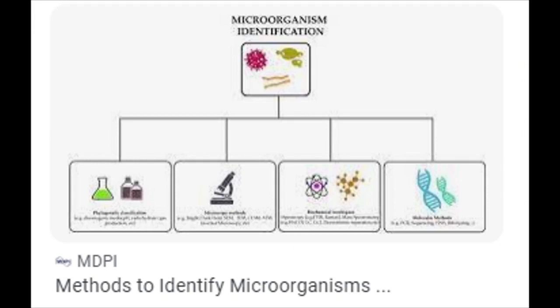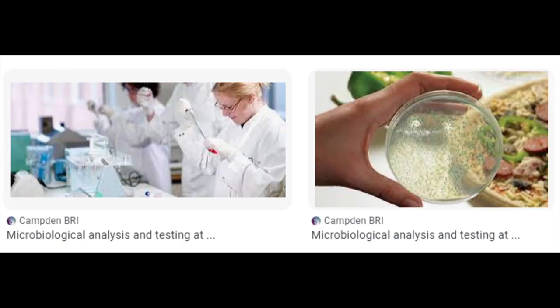So I've told us that in fermented food, you cannot use total mesophilic bacteria. You cannot use total bacterial count for fermented food. Why? Because the microbes are used for the fermentation, and definitely microbes will be many in the fermented food, because microbes are involved, and as the process is going on, more microbes are involved.